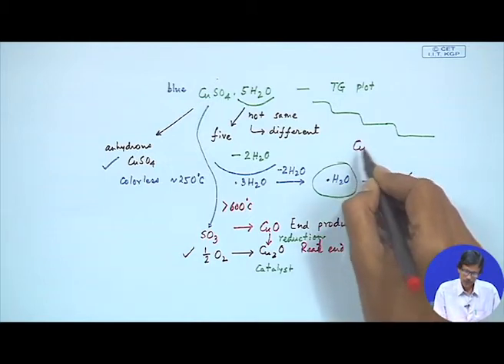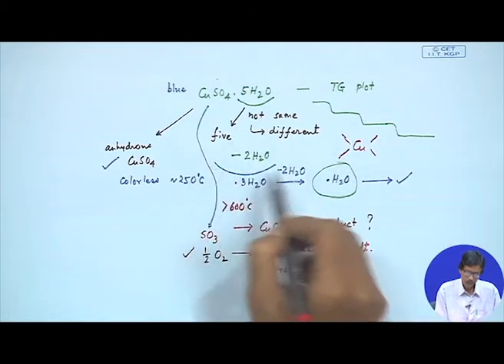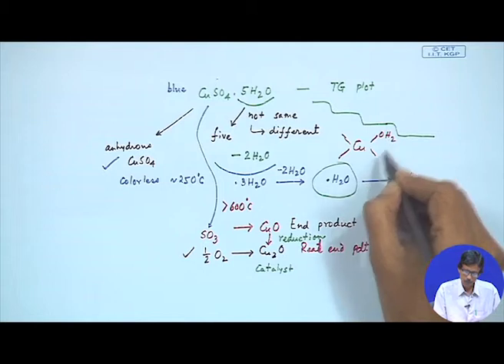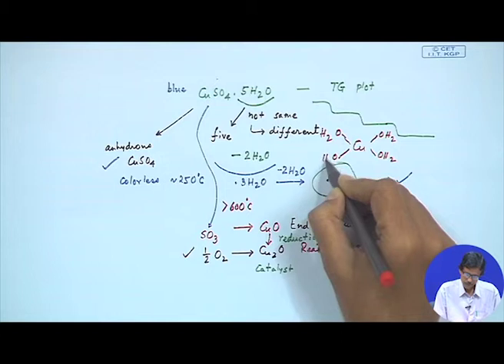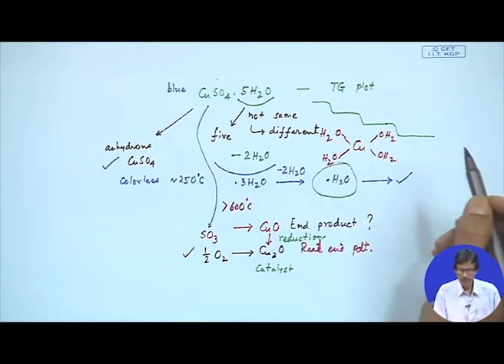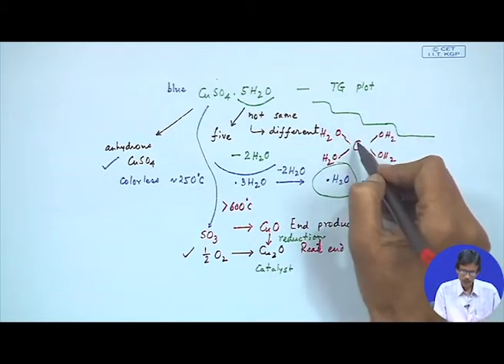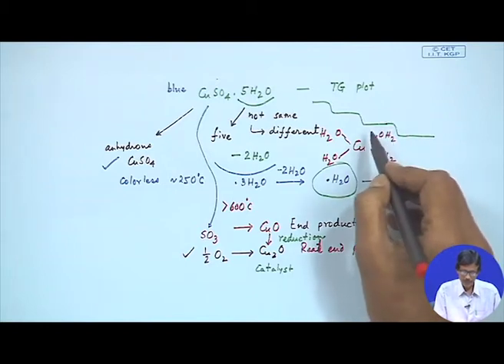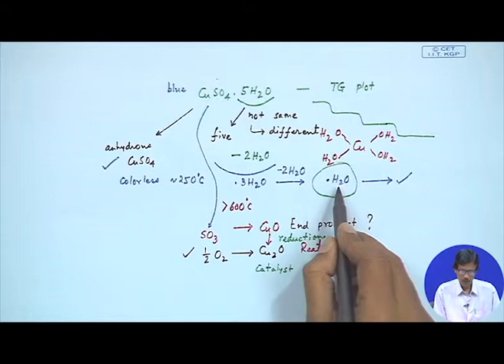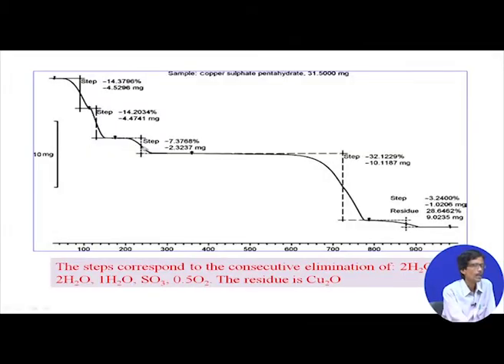So, what we can consider is that we know that copper has a typical coordination number of 4. So, if 4 of them are of the same type, we put 4 water molecules of one type around this copper. Then we put another water molecule and the sulphate anion, which are also entangled with that sulphate. That means some close association of this water molecule with your sulphate will give rise to some extra stability to this particular water, which is lost in the third step.